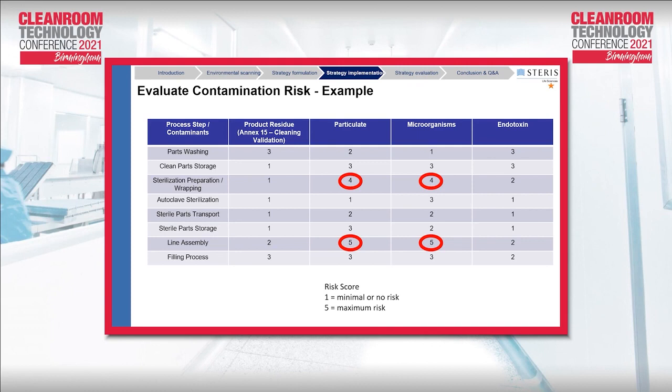This will give us an idea. If it is a high risk, then there is a real need to have an adequate remediation to reduce this high risk to a certain level by implementing appropriate procedures, but also having adequate wrapping types that allow preventing contamination, for example.